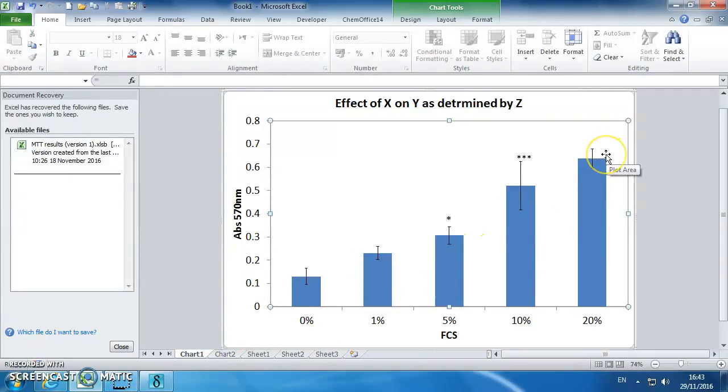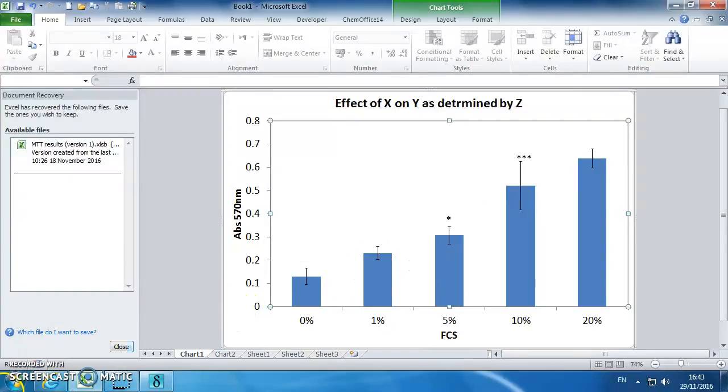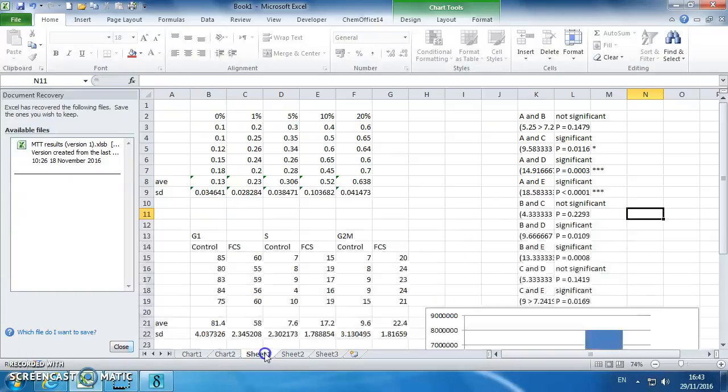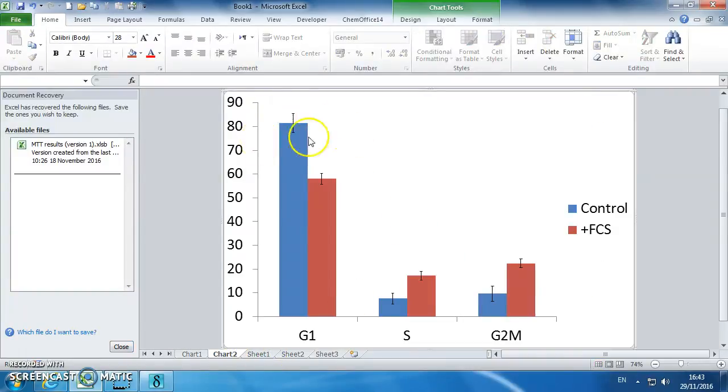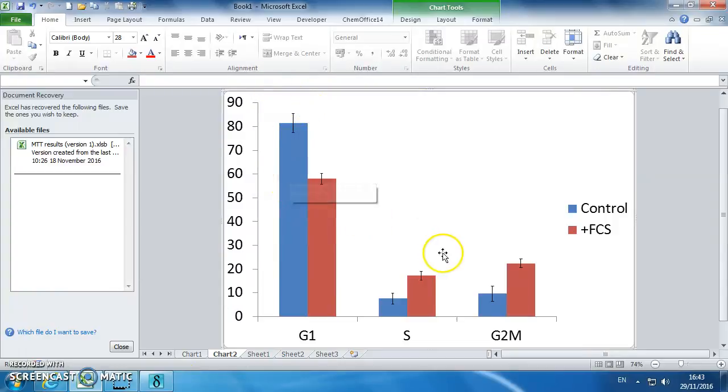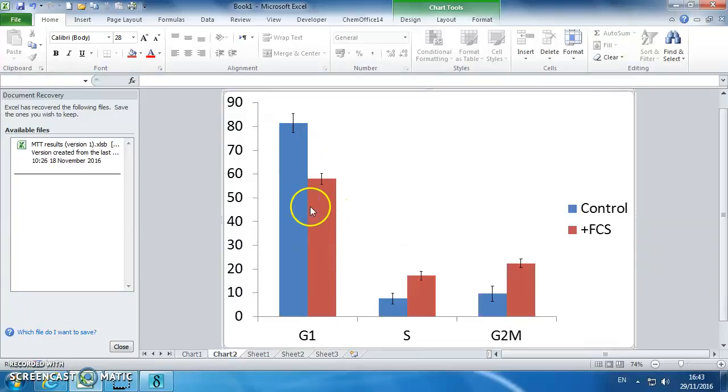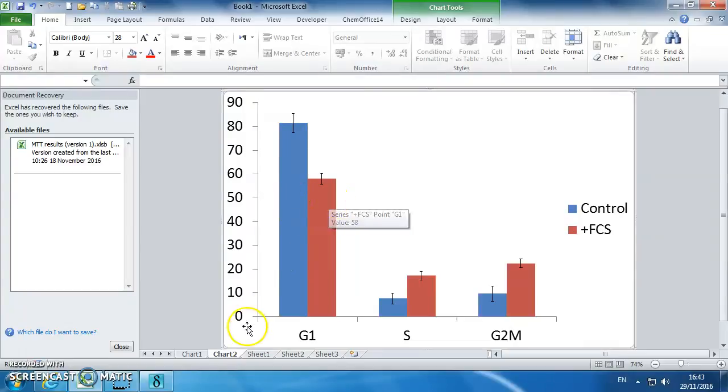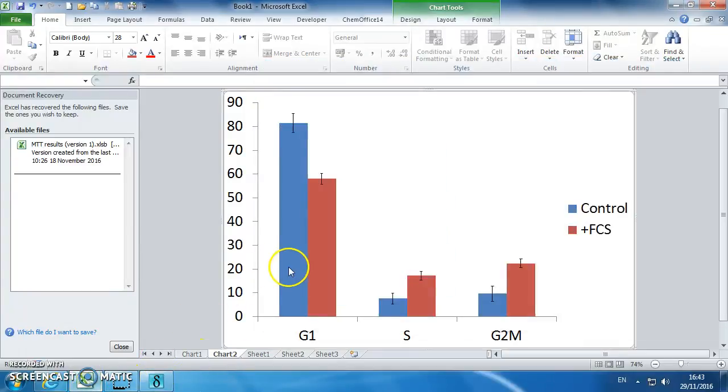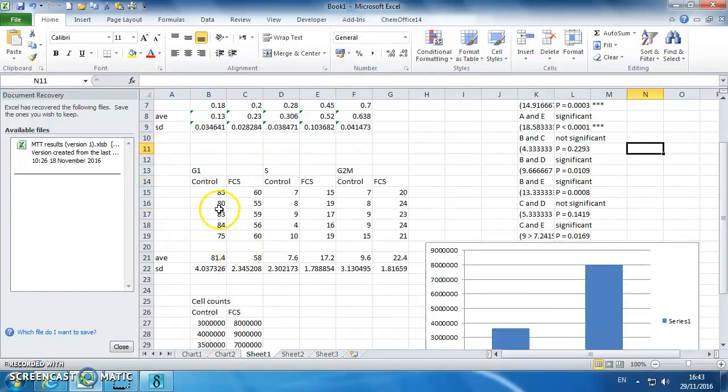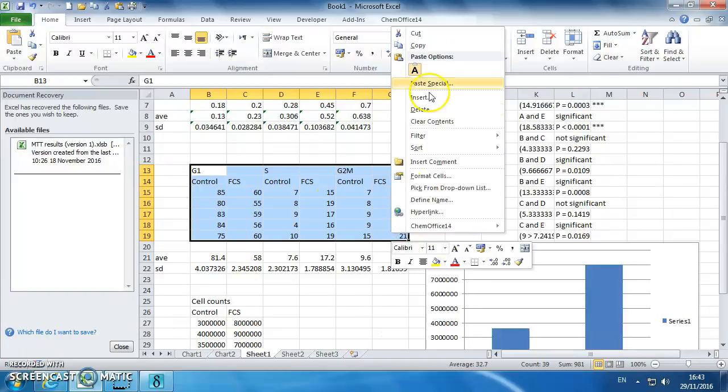If it was normally distributed, which you can test for in StatsDirect by doing the normality test, then you could do an ANOVA instead. Okay, so now I'm going to go back to the cell cycle data, which is this data. Now you want to, you can compare everything if you want to, but what's interesting to me is whether G1 phase is greater in the control versus fetal calf. So we're just going to compare these values to these values, so we're going to put that data into StatsDirect. So put all of this data in.